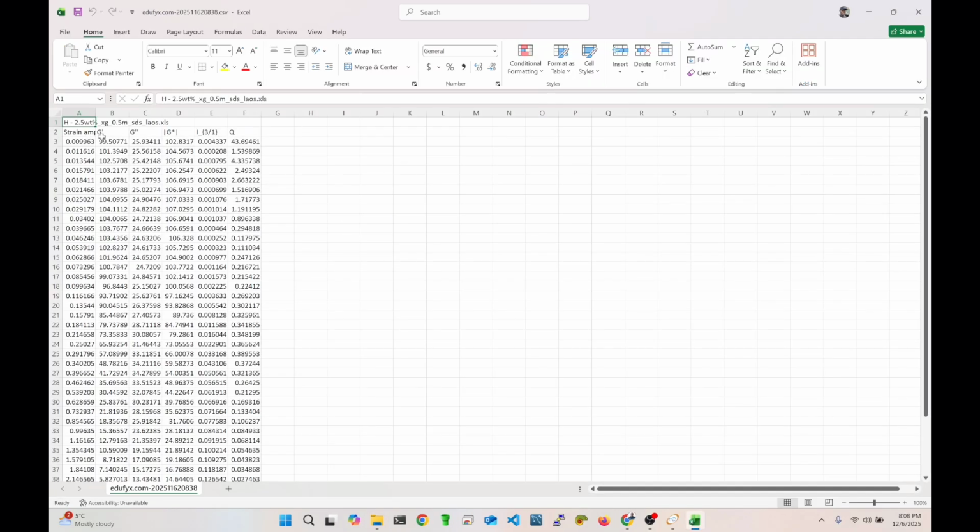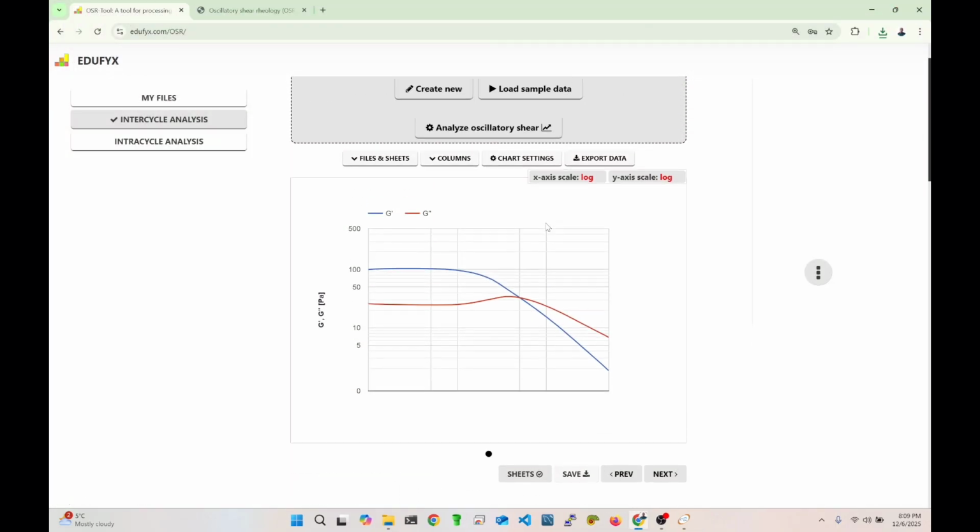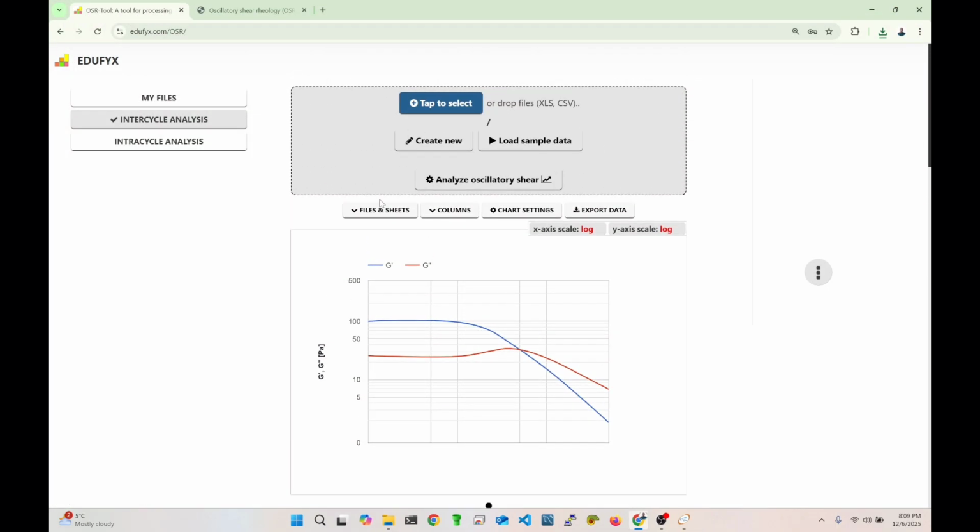So this is the data I've exported. And if you have multiple files, when you make an export like this, all your files will be together. So you are probably going to have one file here, some space, another file, another file. So when I was working actively here, I normally analyzed multiple files at once. So it's up to you. So is there anything else?